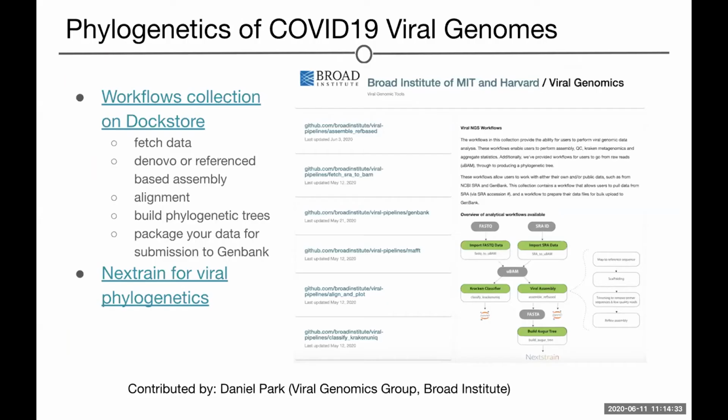Another use case I wanted to highlight that's quite relevant is workflows that are available for phylogenetic analysis of viral genomes, including COVID-19 genomes.